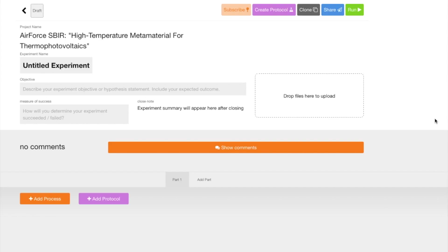In the last video we showed you how to start building an experiment with processes that were already in the system. And this time around we're actually going to show you how to build brand new processes, which is really the focus of your research. How do we build better processes faster, right? And so as we're getting more familiar with this experiment builder, think of this a lot like a better traveler sheet.